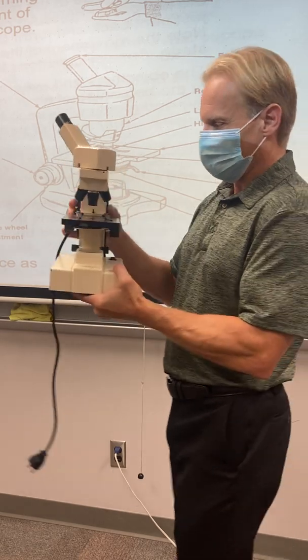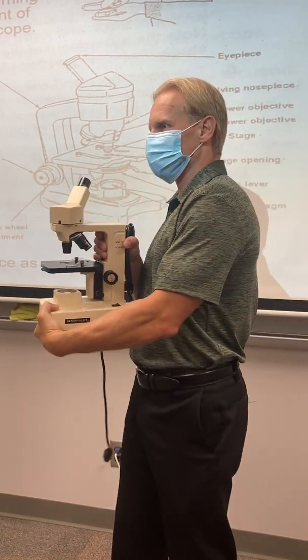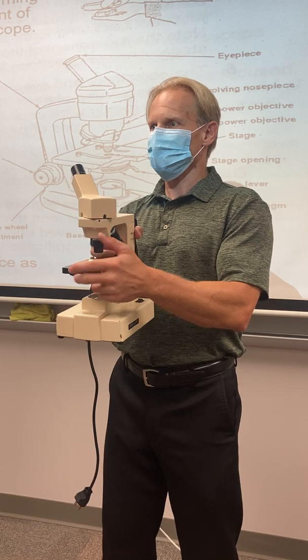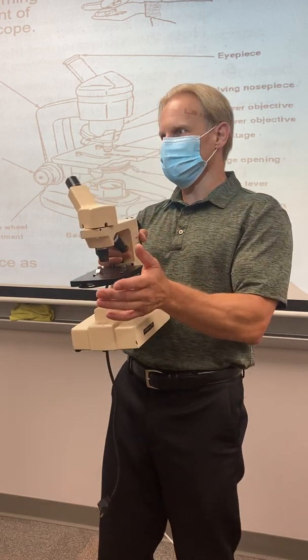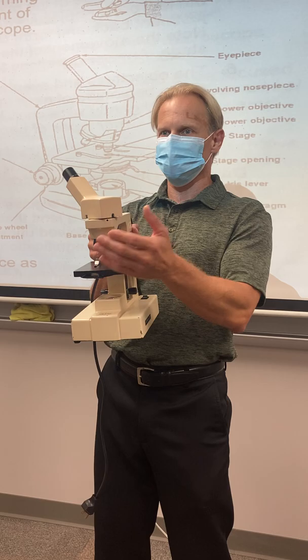And there's an important knob on this thing that most folks don't know about, even if they've learned about a microscope before. It's called the diaphragm, okay? It's this little wheel right here on this one. Others have a little lever underneath. By turning that, you change the amount of light that goes through. Some things that we look at look really good under full light, as much light going through as possible.